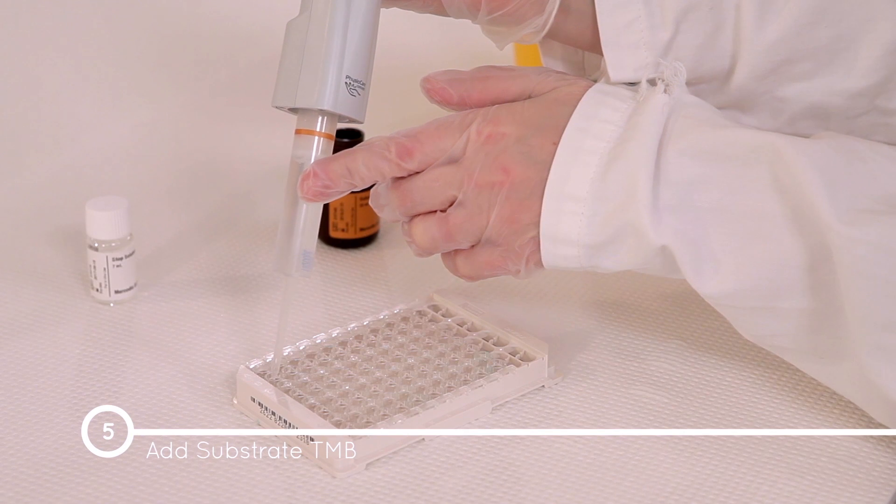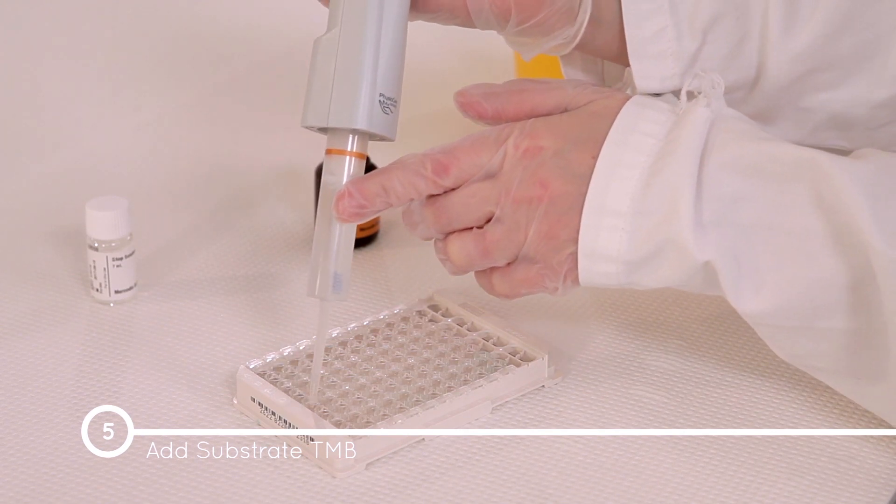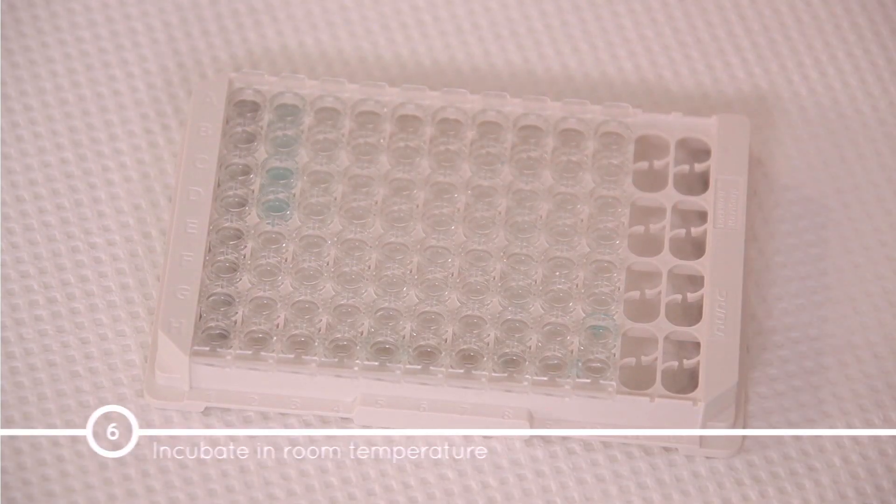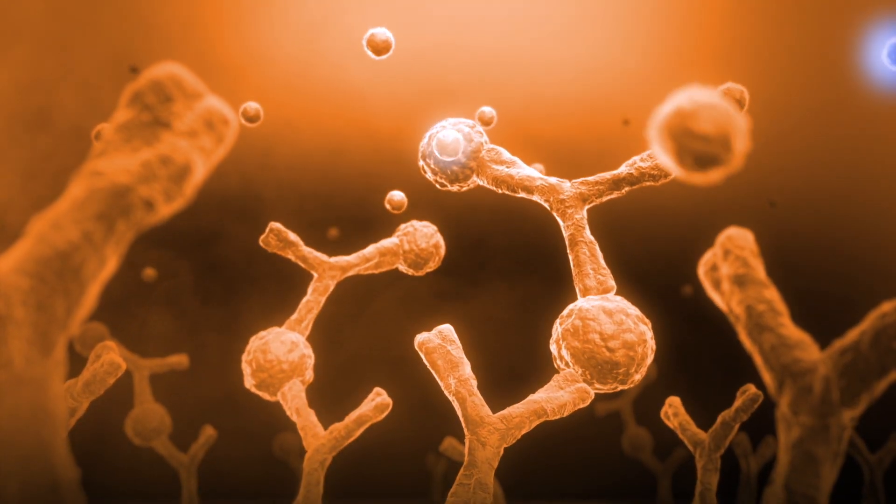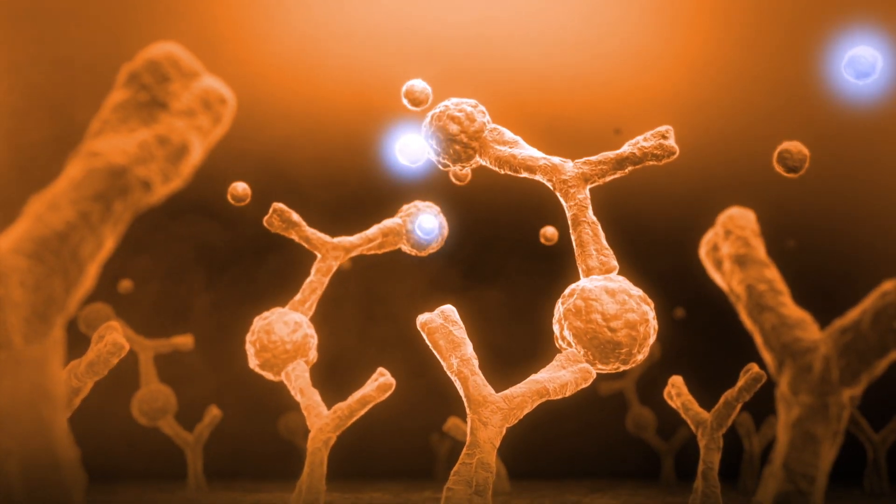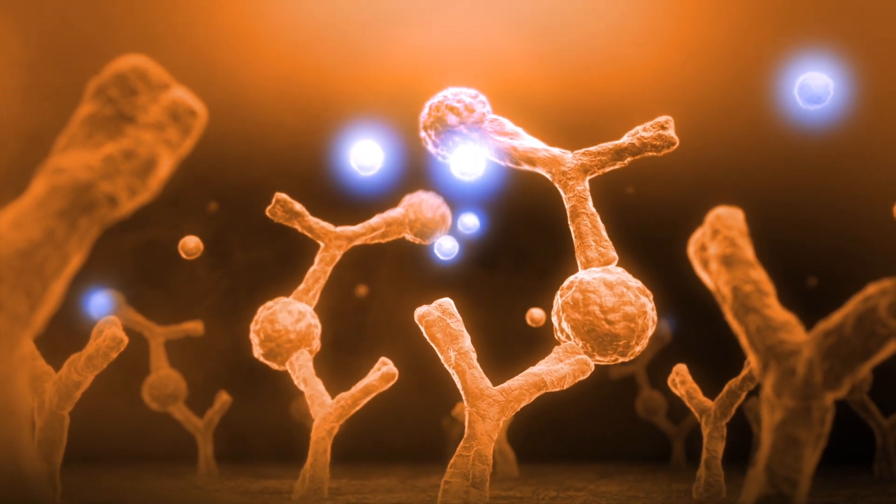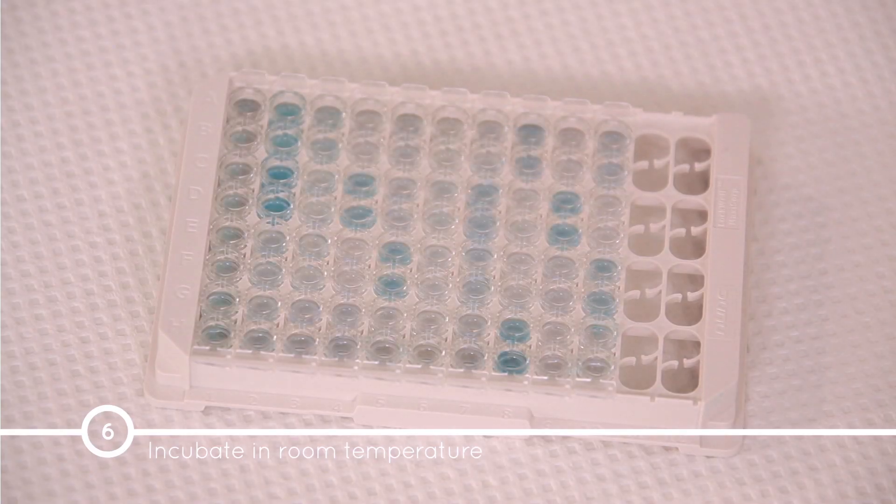Change the pipette tip and add 200 microliters of substrate TMB into each well and incubate on the bench for 15 minutes at room temperature. The substrate is converted by the enzyme to a chromogenic signal and the wells that undergo a reaction will turn blue.